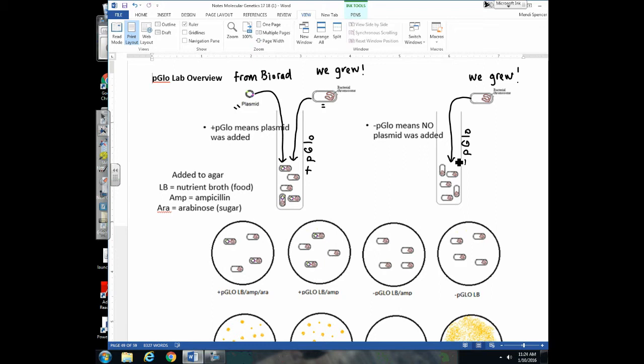Now, both of these vials are going to be heat shocked because we have to keep that constant between these two samples. So we're going to heat shock this one and this one. Remember, it's the heat shocking that is going to make the plasma membrane of these bacteria cells a little more permeable and hopefully allow some of these plasmids to move into the bacteria cells.